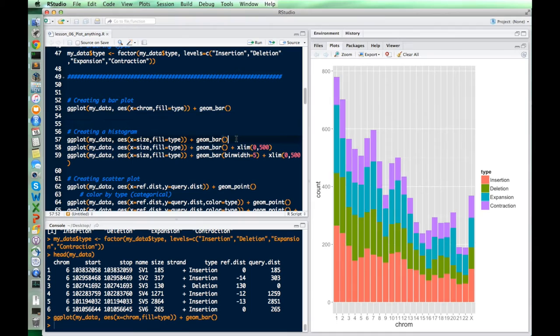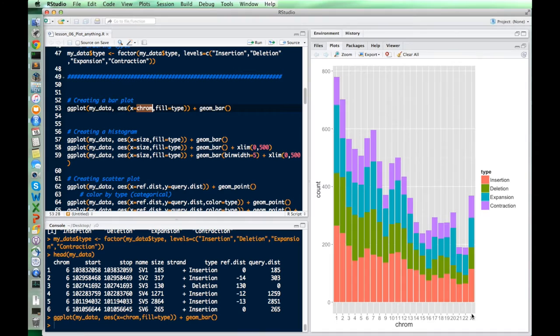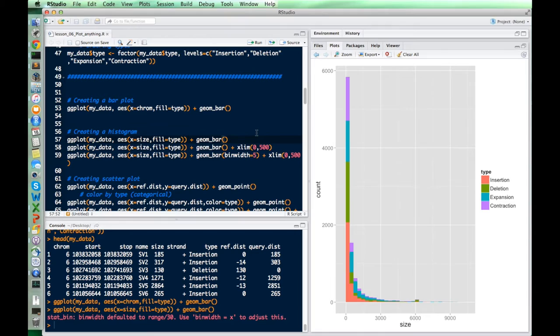A histogram looks really similar. The only thing we change is the aesthetic — the x-axis now becomes size, which is a numerical variable instead of chromosome which was categorical. When we draw this bar chart that's actually a histogram, each size doesn't get its own bin; they're grouped into bigger bins. If we want a better view of just the smallest variants, we can set xlim from 0 to 500, so anything beyond that is not included in the plot.